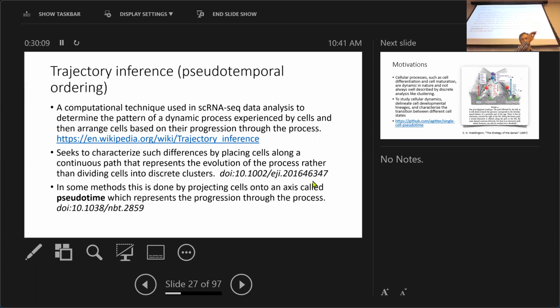So you can do this pseudotime trajectory for them collectively, or you do this independently, and then link those cells from one time point across to another time point.